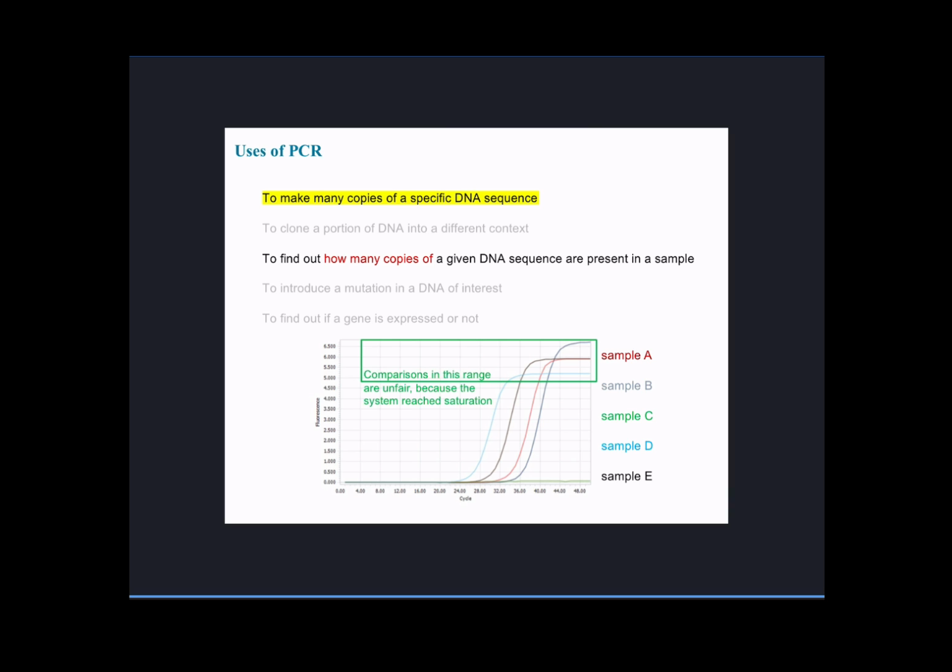The human eye is not very quantitative to start with. It's hard to distinguish different degrees of intensity with a naked eye. And if you go for really low fluorescences, such that you know for a fact you're going to be in the linear range, then your eyes can't see it.